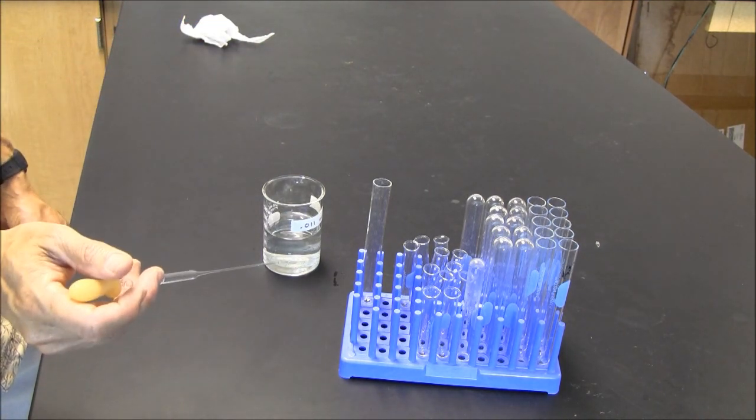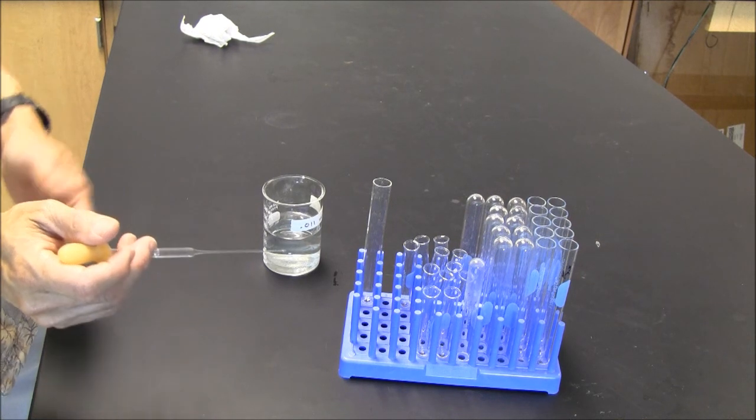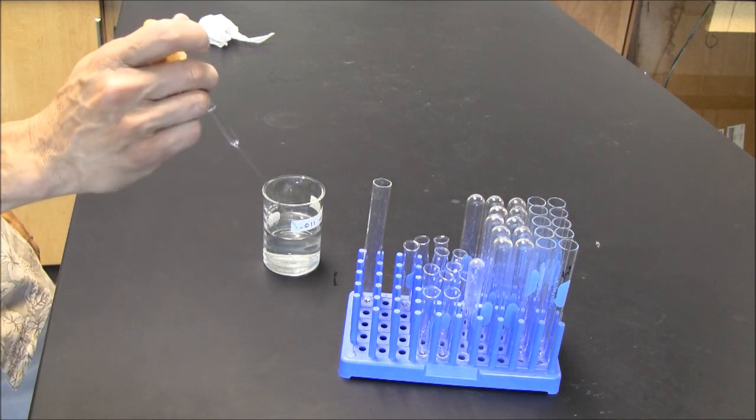Beginners also tend to tilt their pipette, thinking the liquid will drip out, but you can see nothing drips out. Atmospheric pressure is plenty strong enough to keep the liquid in the pipette. So keep your pipette more vertical.